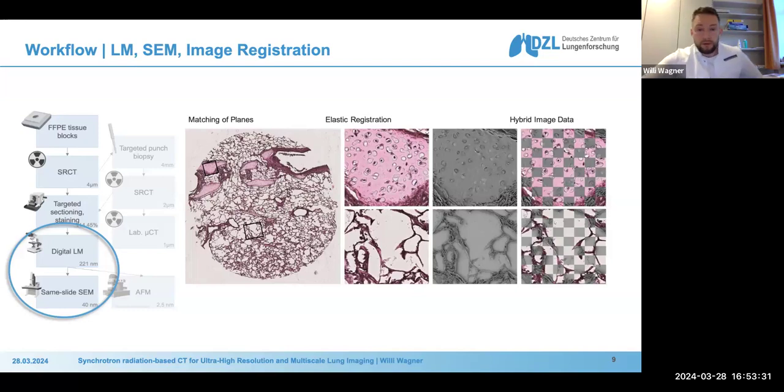And also in this talk today, and I believe with you in Australia at the moment, is Lorenzo, who integrated atomic force microscopy into this imaging protocol. So he is able to gather micromechanical information about viscoelasticity of any given tissue type and integrate this into the three-dimensional plot. But I will show you in a second.